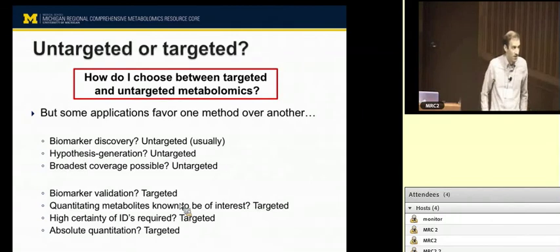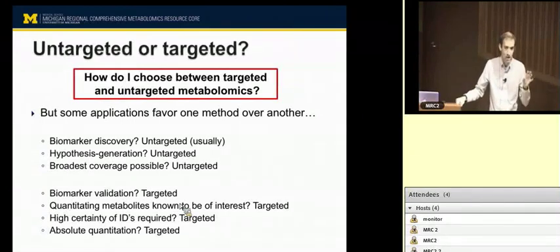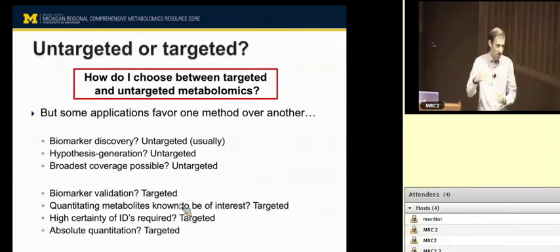Yeah. In the untargeted workflow, do you use technical replicates, instrument injections? Good question. So sometimes yes and sometimes no. So repeating the question: in untargeted analysis, or targeted for that matter, do we use technical replicates of samples to assess reproducibility, et cetera? So quality control is an important part of any metabolomics experiment, and it's always essential to have some form of technical replication within a study to get an idea of how reproducible your data are.